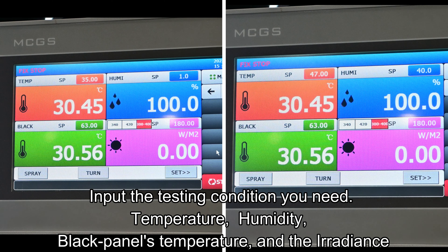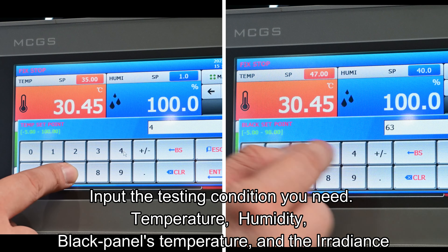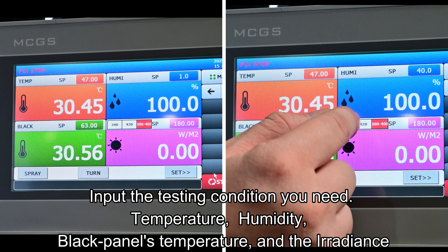Then, input the testing condition you need: temperature, humidity, black panel temperature, and the irradiance.